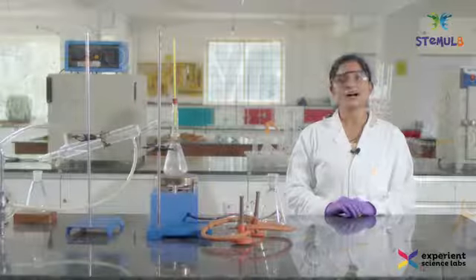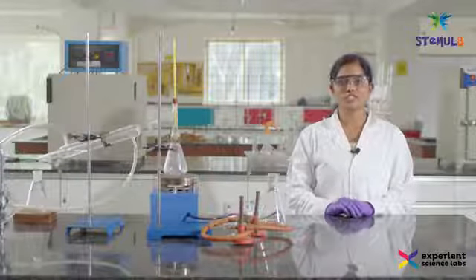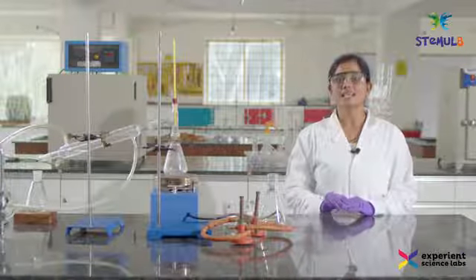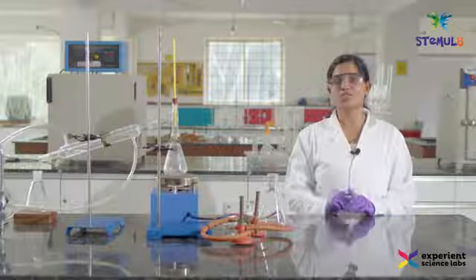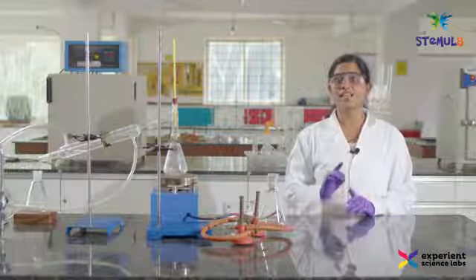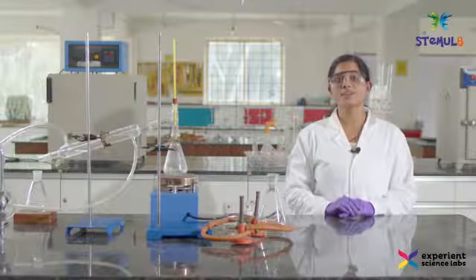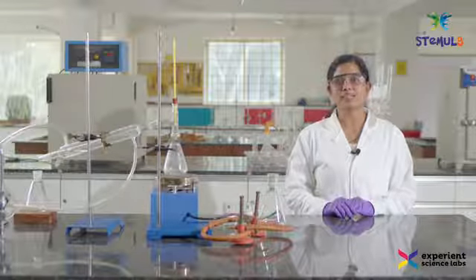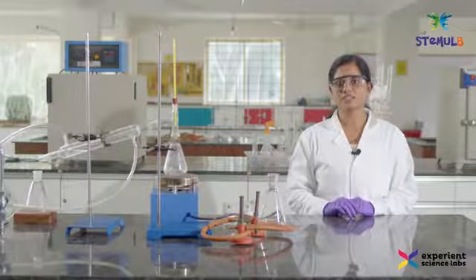Hello everybody, I'm back with yet another very simple but crucial demonstration. This particular experiment is very important in large-scale industries like petrochemical refineries and in purification of solvents. So what is this experiment? This experiment is separation of miscible liquids by distillation.